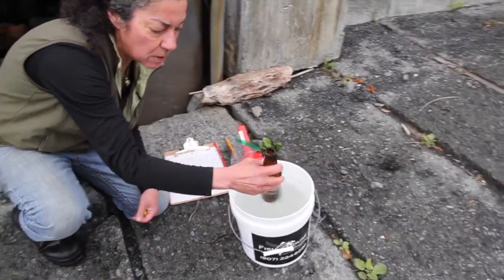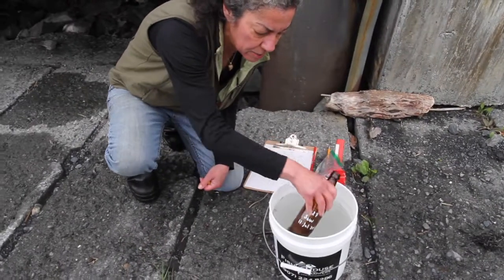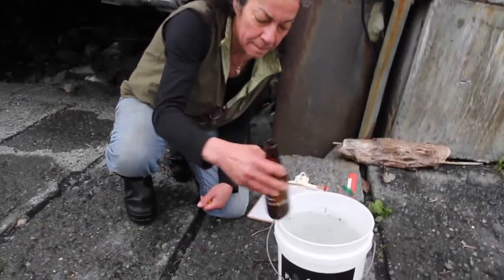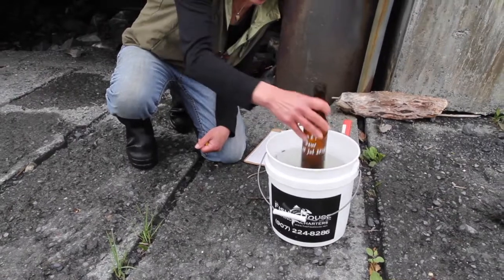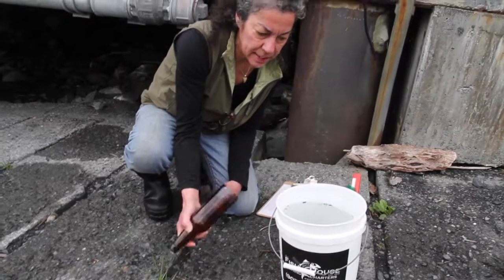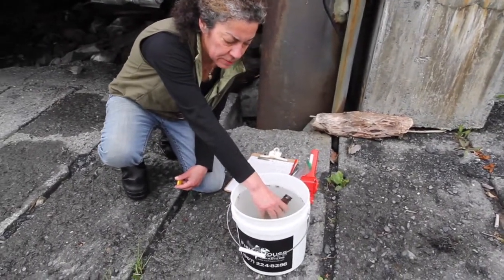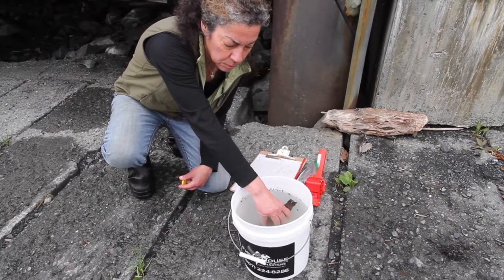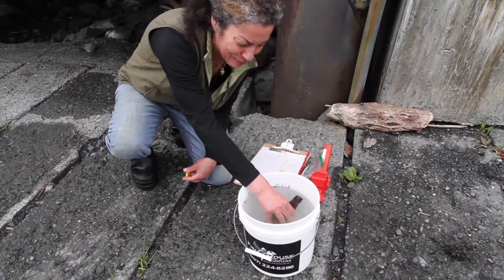I'm just going to take a little bit of water and dump it. That's my rinse water — I don't want that going into my sample. It wets the surface of the glass so that it can receive water without causing any bubbles. Bubbles are our enemy in this water sampling process.